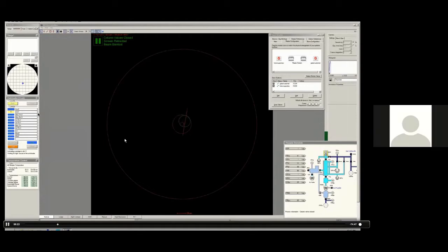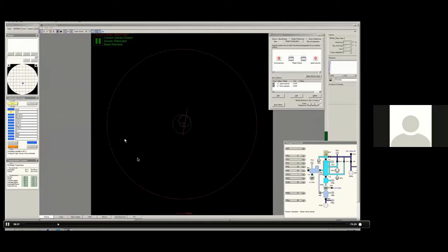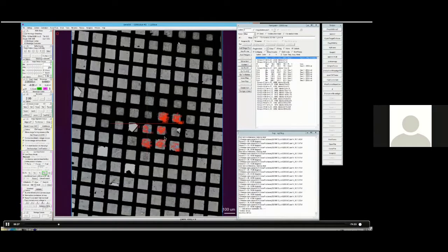Hi, Dr. Liu, you have two questions. Yeah, go ahead. Sorry, I feel bad interrupting you. No, it's okay because this is a long break. Okay, first question, can you use FastTomo to collect multiple data points in sequence, so set up an overnight data collection?